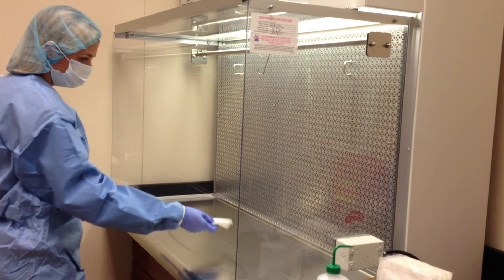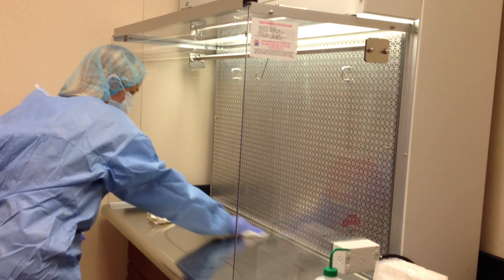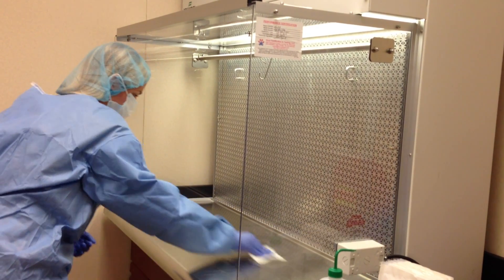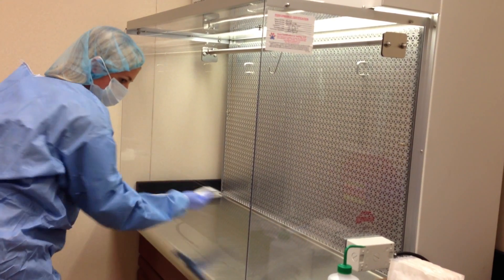Clean the work surface of the hood last, beginning in the back and working in a horizontal motion from side to side with overlapping strokes towards the front. Do not contaminate previously cleaned surfaces at any time during the process.